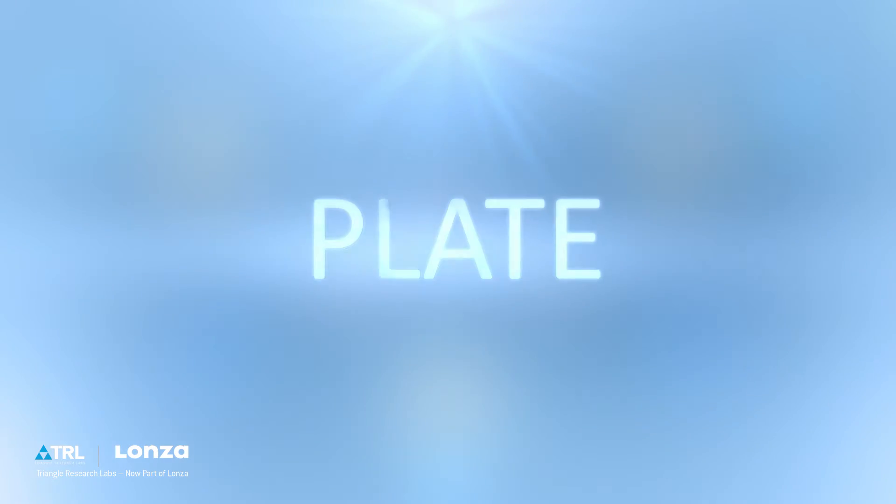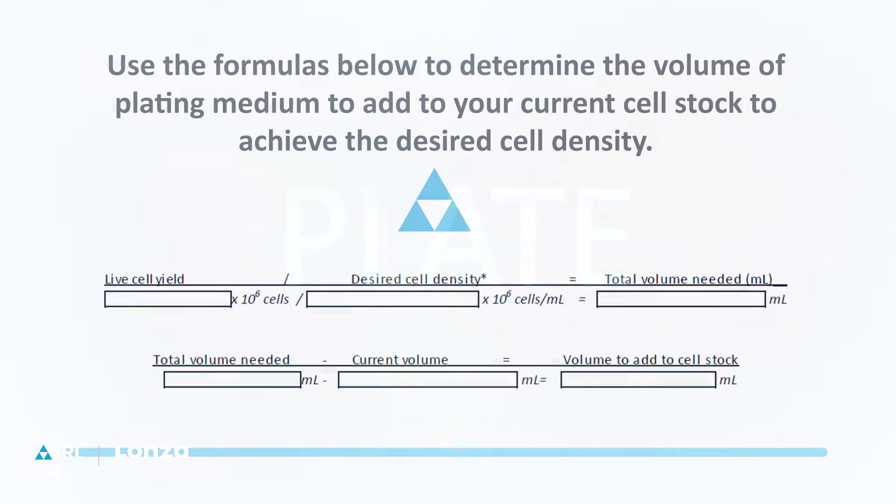Plate. Use the formula in the thawing and plating protocol to calculate the volume of plating medium necessary to add to your cell stock to achieve the desired seeding density.